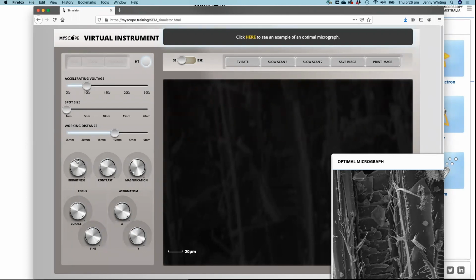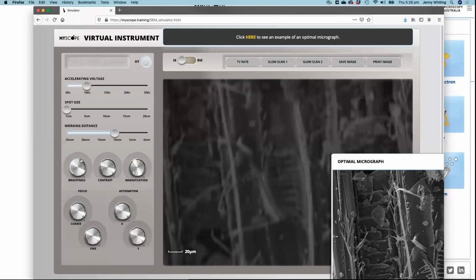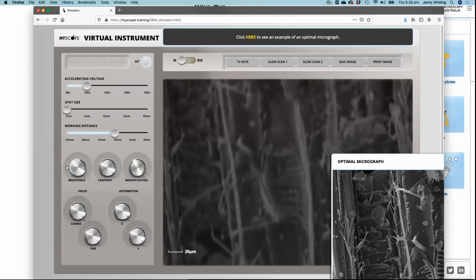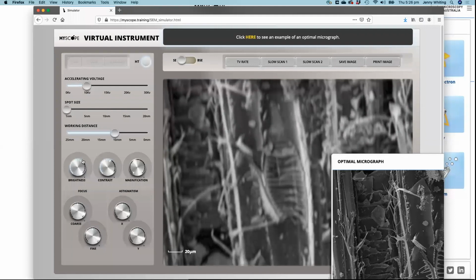First of all, I'm going to turn up the brightness here. We don't twiddle these. If you start zipping them backwards and forwards, that's not such a good idea, but we want to move them gently, and you can move them anywhere in this area here. I might take that brightness up a little further. Okay, that's not too bad.